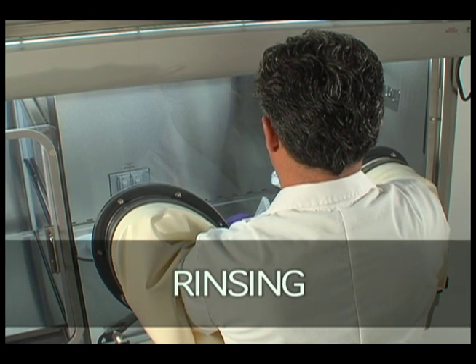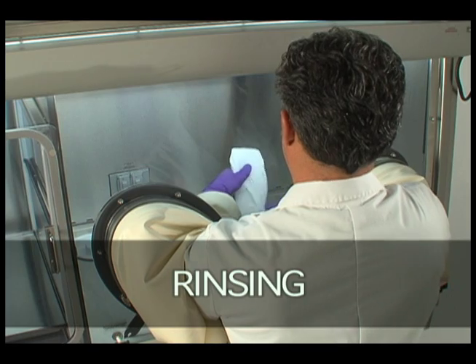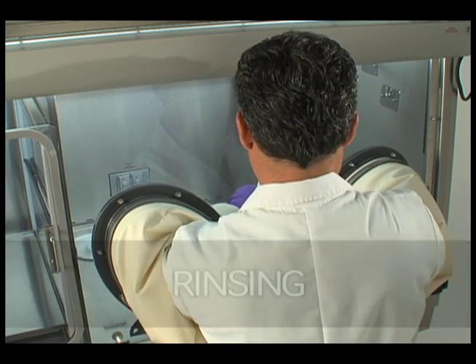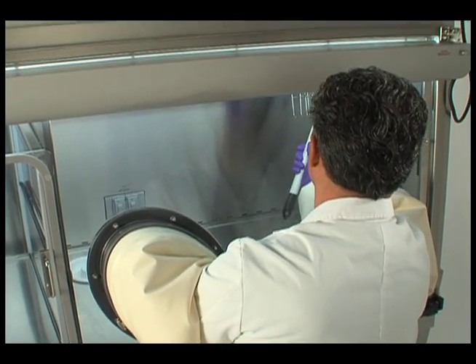Rinsing: Use wipers or mops pre-treated with sterile deionized water or 70% IPA to remove the cleaning agent. Be sure the last wiper used does not retain any visible residue after wiping down surfaces.